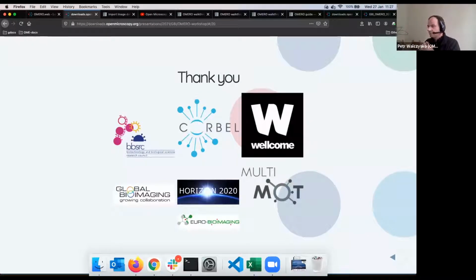Okay, so the hardware maintenance, backups, upgrades, security patches of the server, etc. This is all up to you, and you must do it. Okay, and the OME team is just delivering the free open source software.